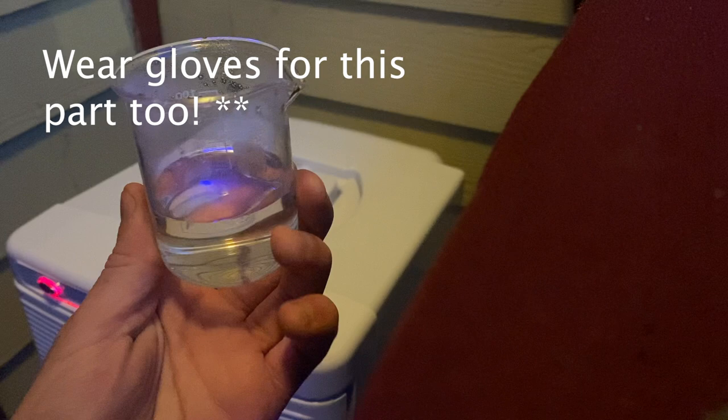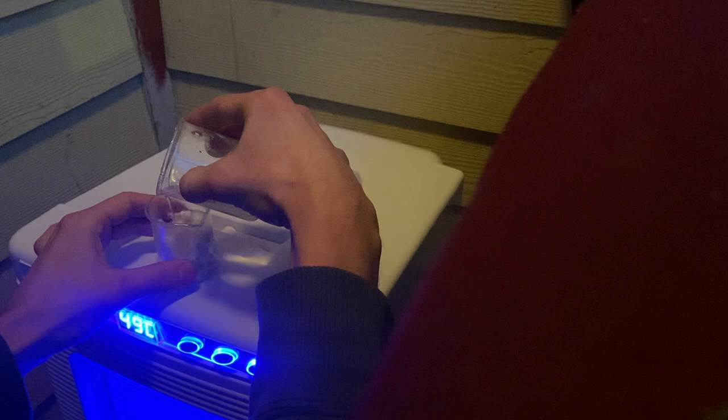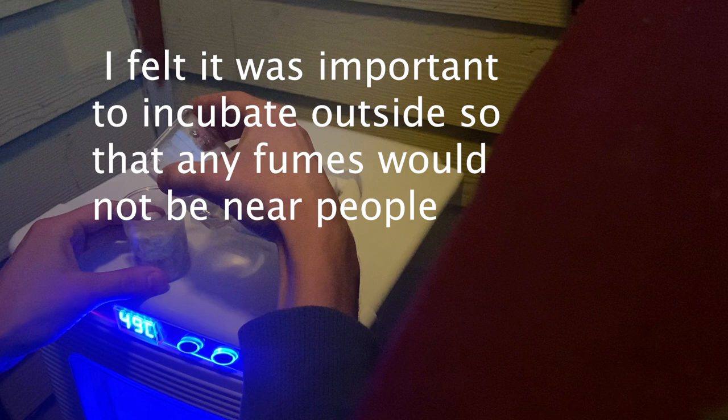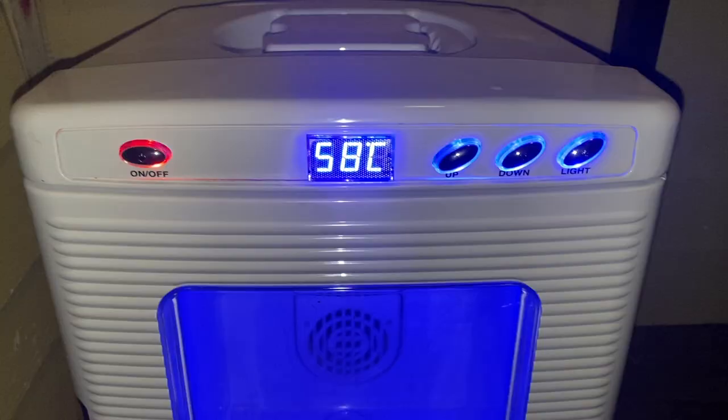I was trying to be very careful. Just be as careful as you can doing chemistry at home — I don't condone this kind of activity; I did this at my own risk. I wanted to incubate outside because of the fumes. I added it into the incubator at 49 degrees Celsius, let it incubate for about four hours, checked it, and it still looked the same. Total incubation time ended up being about eight hours.